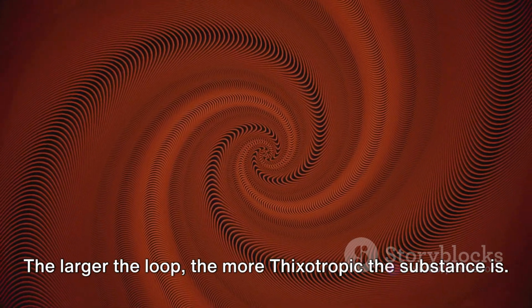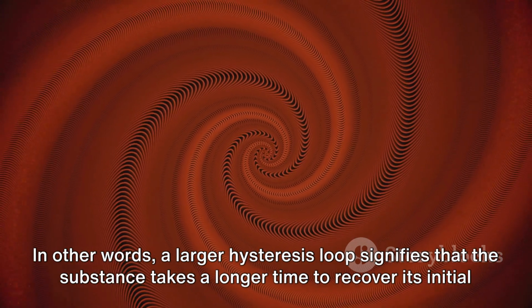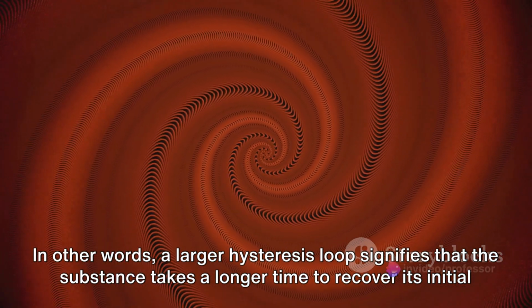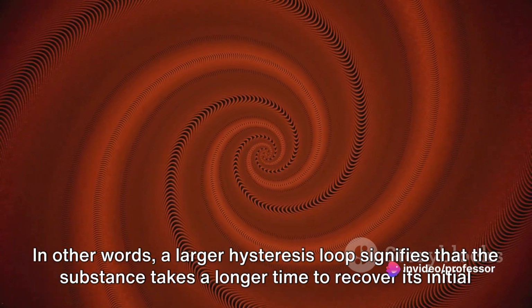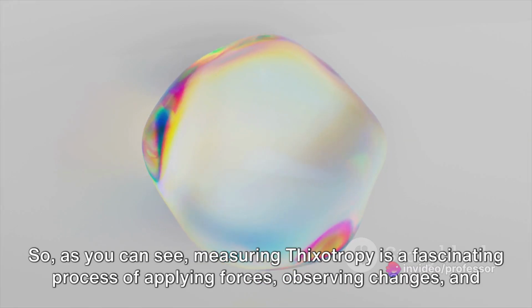The larger the loop, the more thixotropic the substance is. In other words, a larger hysteresis loop signifies that the substance takes a longer time to recover its initial viscosity after the removal of shear stress.